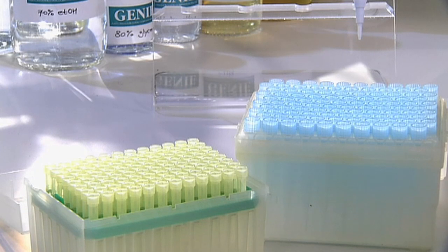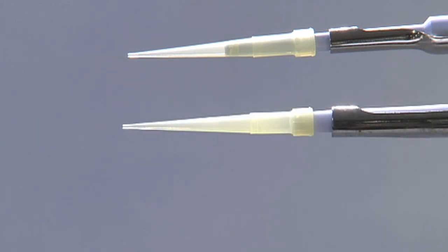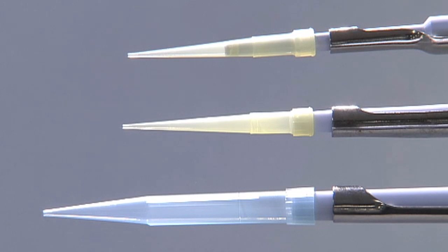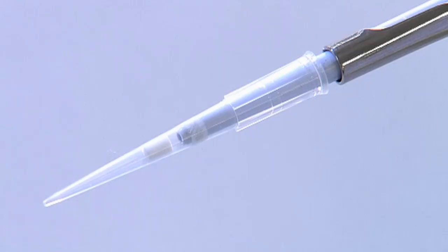Once you've set the volume you need, attach the appropriate pipette tip to the end of the pipette. P20 and P200 pipettes use the same yellow tips, while P1000 pipettes use larger blue tips. Another type of tip called a filter tip is often used in the laboratory — the sterile filter within each tip can help to prevent contamination.